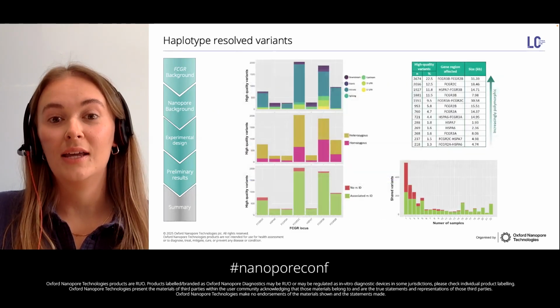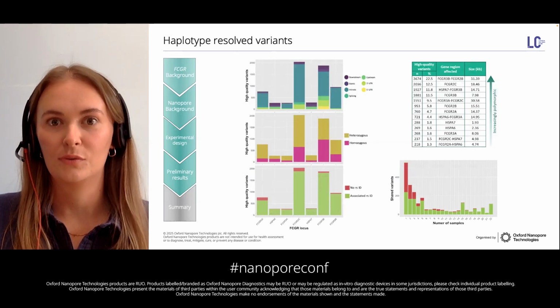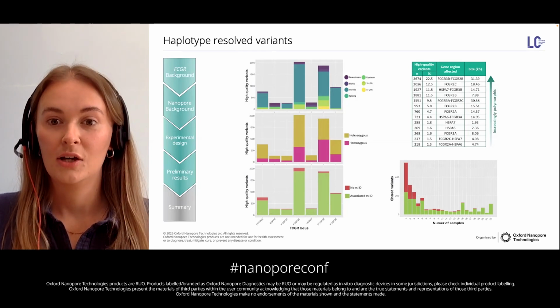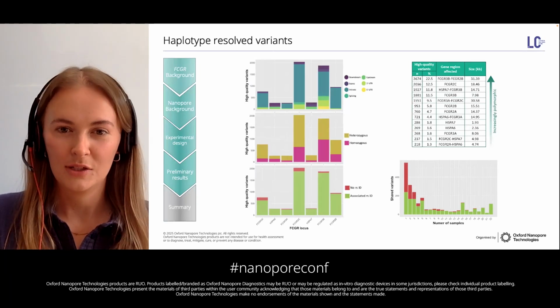And beyond individual variants of interest, Nanopore enables us to appreciate the entire FcγR receptor locus in its full context, something previously out of reach with standard short read or targeted primer-based approaches, which fragment and obscure the bigger picture.